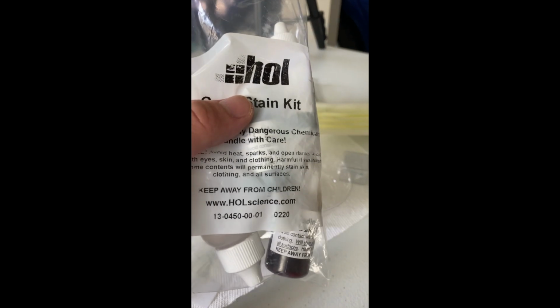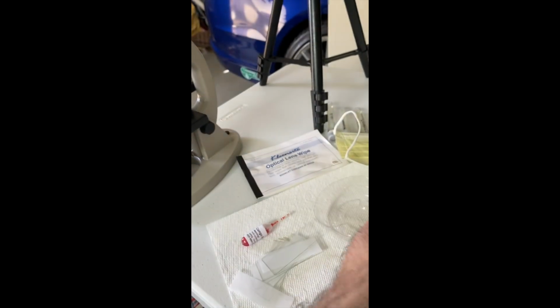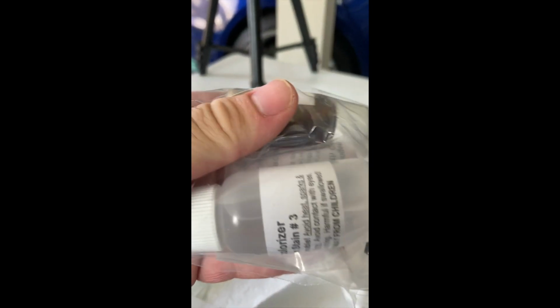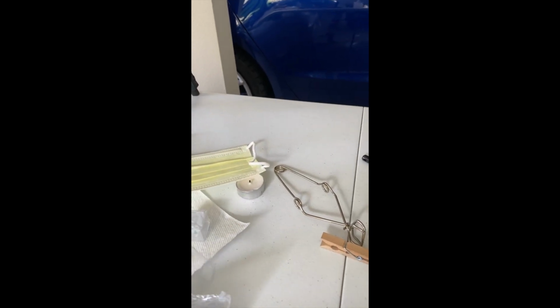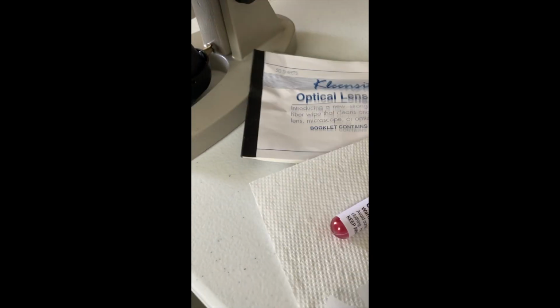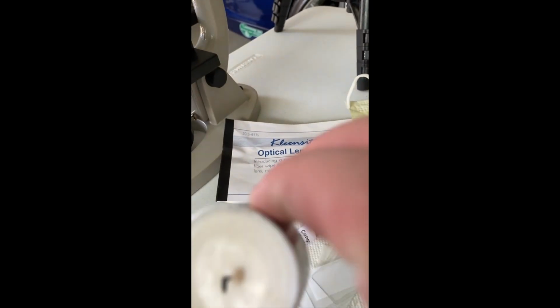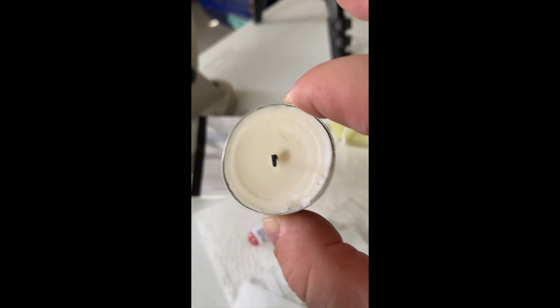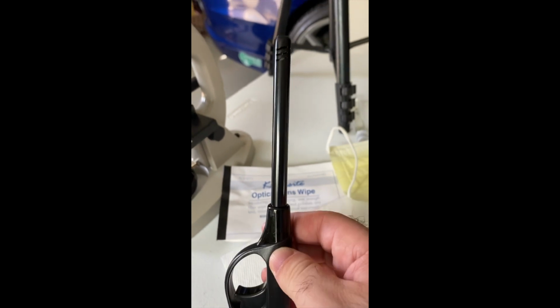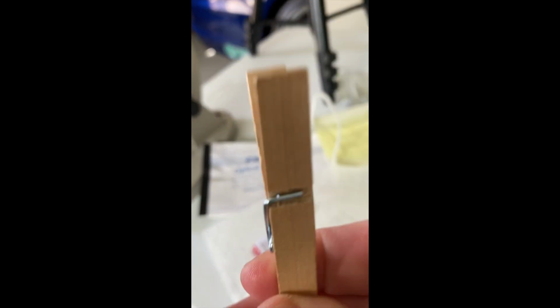I also have a gram stain kit that contains safranin, crystal violet, a decolorizer, and iodine. I have a face mask that I'll be putting on shortly. A lens wipe just to clean the lens of the microscope when I need it, or the slides themselves. This tea light will be used to heat fix, or to basically heat the slide from underneath to fix the specimen. I have this to light my candle, and then I have a test tube clamp and a good old clothespin.